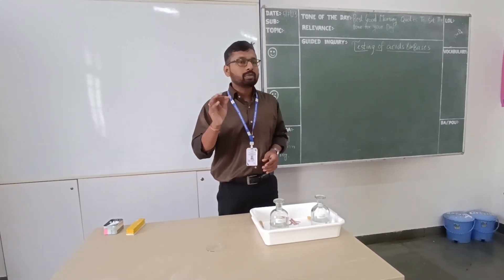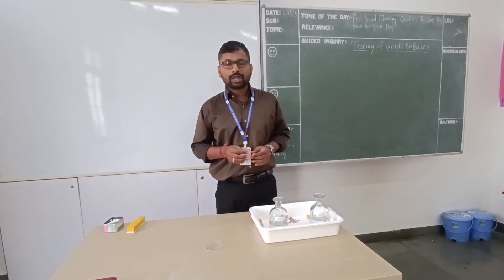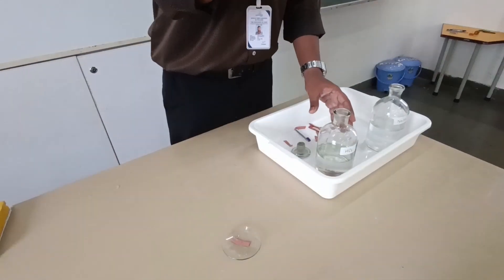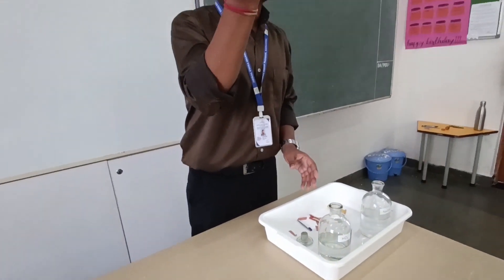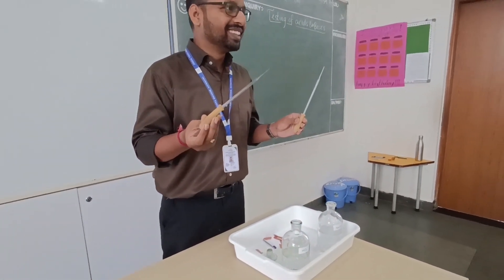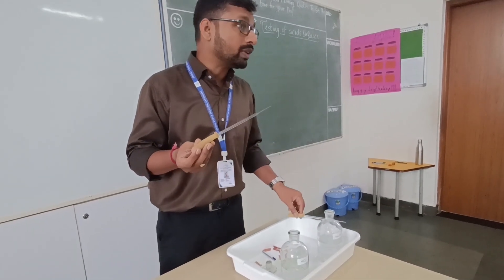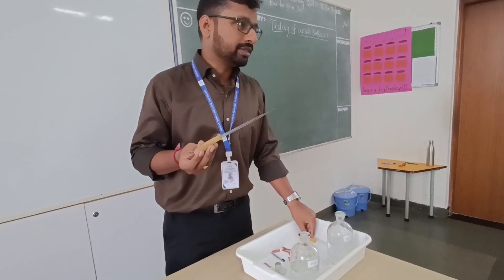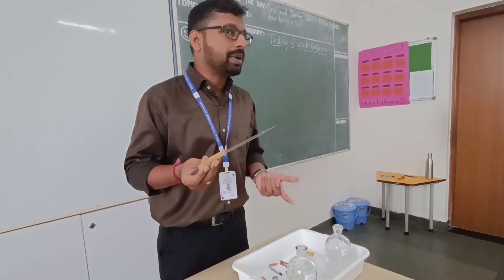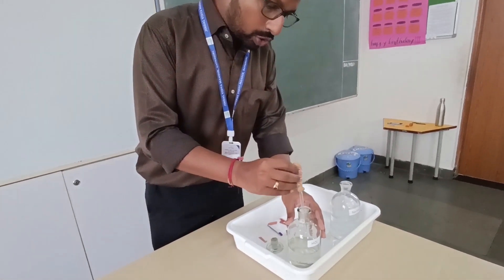What is the test for that? We have two types of litmus paper — one is red and another is blue. Let us check now. What we have here is called a dropper. Why do we have two droppers? They should not get mixed, otherwise they will react — and the acid will not remain acid and the base will not remain base. Now I am dropping in the acid.